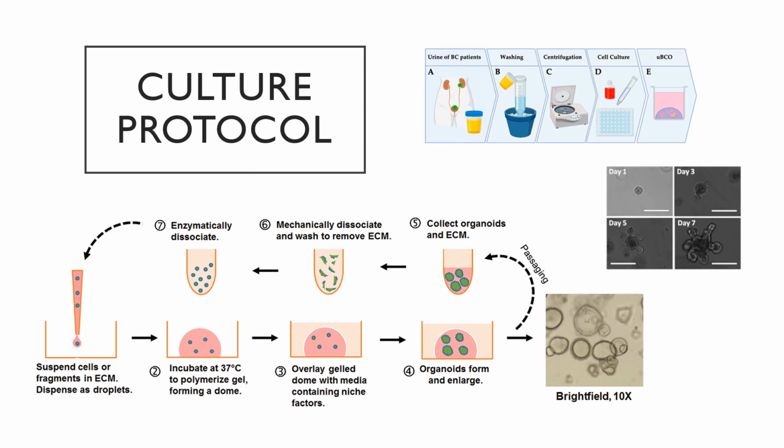Organoids should appear in culture within 3 to 7 days as small ring-like or spherical structures with smooth, defined edges. At 7 to 14 days, larger, clearly visible organoids should be apparent. Model-to-model morphology can vary significantly, with some being small and solid pebble-like organoids and others being large and balloon-like. The 4 black and white pictures on the right are an example of an organoid at different points in time and development.